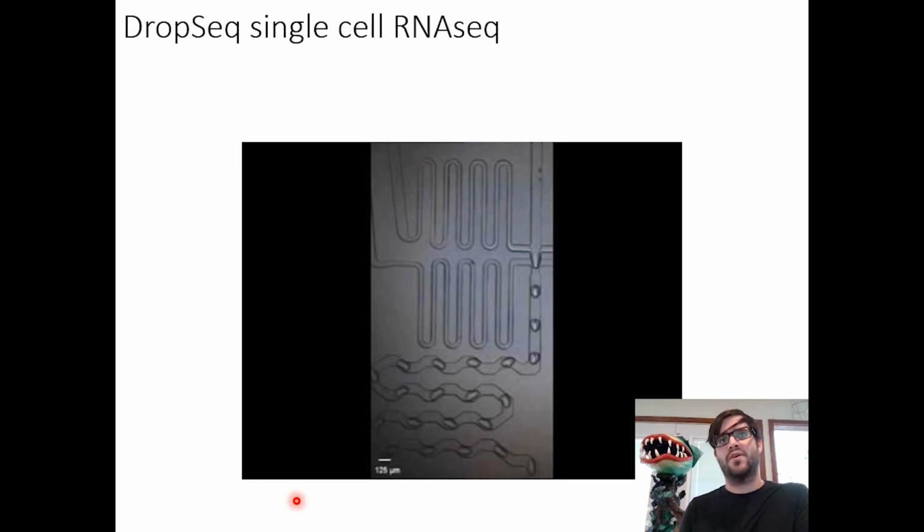You do these things with a certain dilution, so maybe only 1 or 10% of our cells actually have the droplet that we want, that have a bead in them and an individual cell, and you can go down and make an RNA-seq library from each one of these. So this is kind of the emerging frontier of where this is going.